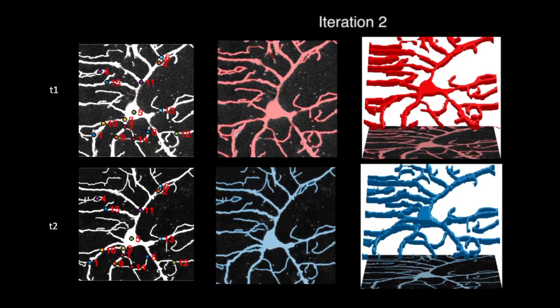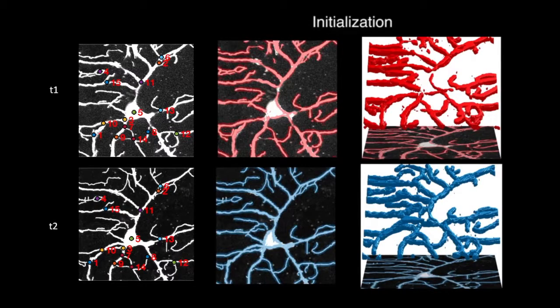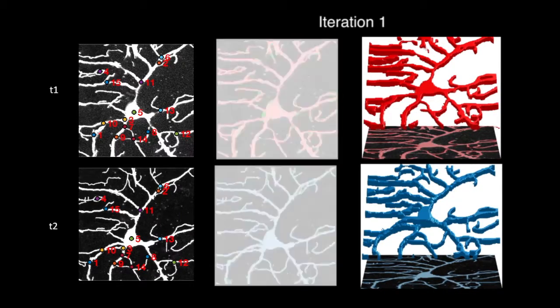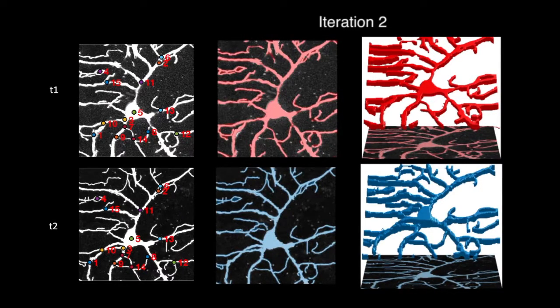Our method is executed in an iterative manner. The initialization is computed by thresholding vesselness produced by the optimally oriented flux method. It requires only a few iterations to recover connected segmentations without gaps, and it is able to handle data with spatially inhomogeneous signal-to-noise ratios.